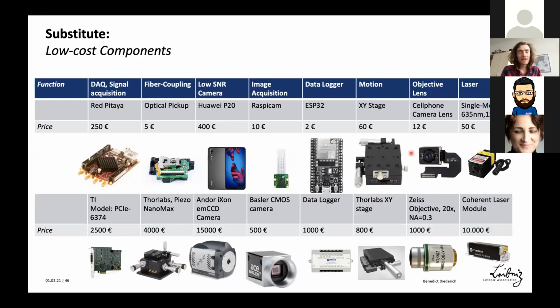But at first, I would like to show you this slide here. That's one of my favorites, and I always need to go back. Okay, what's the replacement for a heavy laser? Okay, of course, a small diode laser, which rapidly can burn your eyes. So take care. Or like a cell phone camera instead of an EMCCD camera. Well, of course, the comparison is not really fair, but for many purposes, it kind of works okay-ish.